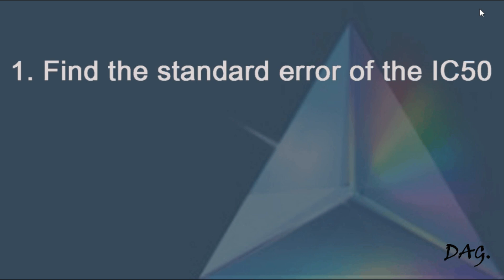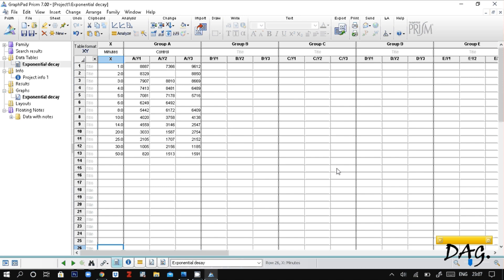How to find the standard error of the IC50 value. Here I have some sample data from GraphPad Prism. In this sample data, x represents the time in minutes and here we have response values in triplicate.